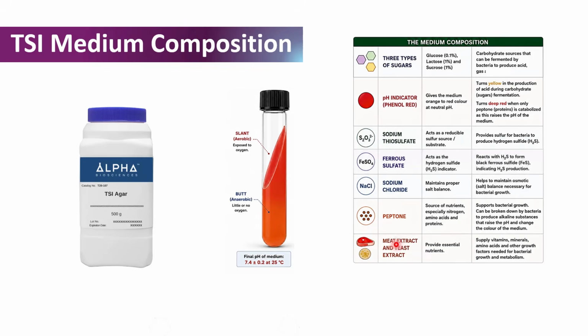And another component is the meat extract and yeast extract that provide essential nutrients by supplying vitamins, minerals, amino acids, and other growth factors needed for bacterial growth and metabolism in the medium.